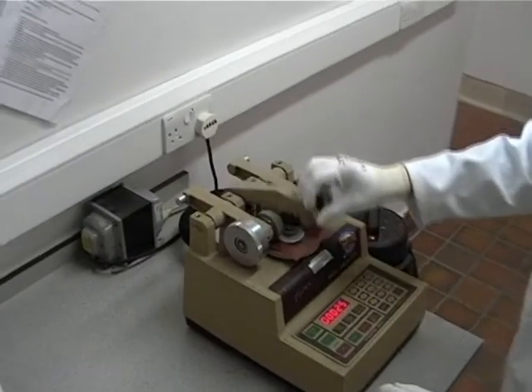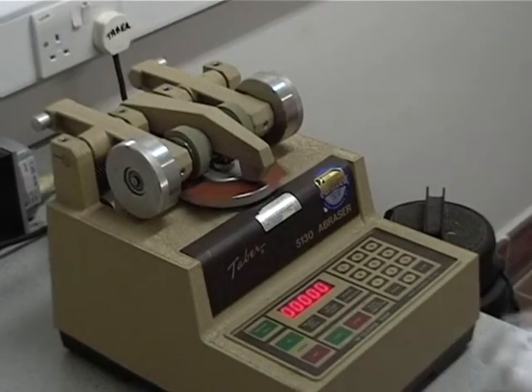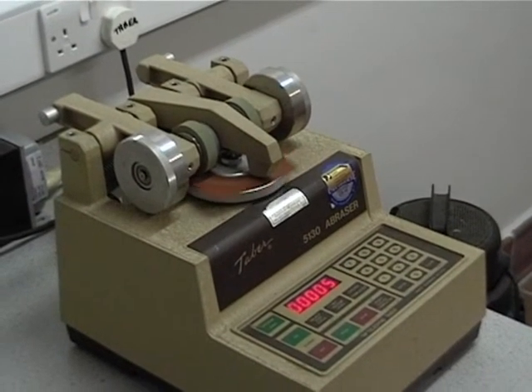In this case, the machine is set to run for 500 cycles. The machine spins the sample and the abrading wheels gradually work away at the surface of the paint coating.